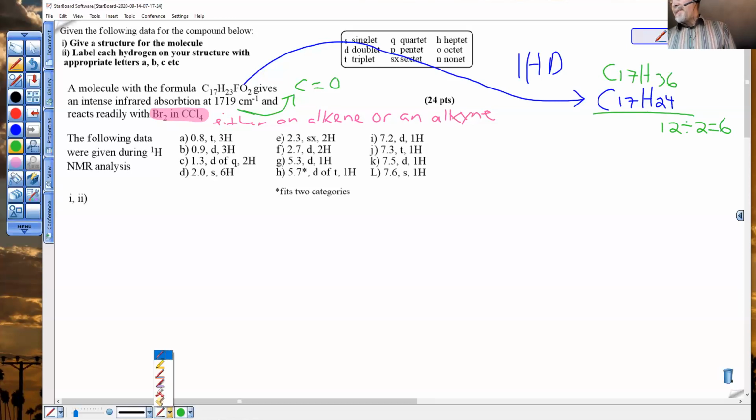when I see data in the delta 7 region, which I see here, this means but one thing. When we have peaks at 7 ppm, we're talking about a benzene being present. And if you're not sure about that, then I just direct you towards tests. And I have a test handy here.